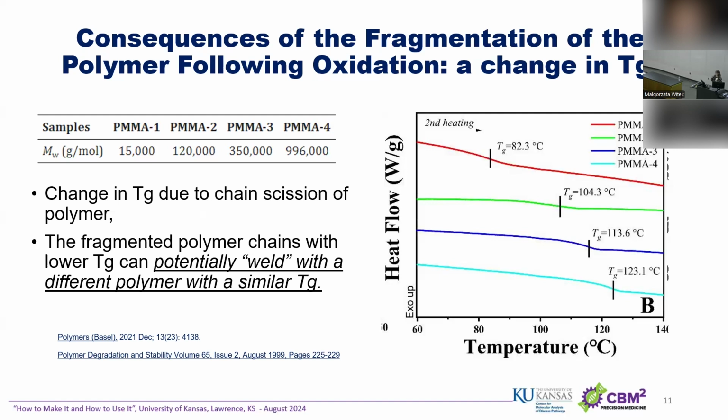When we do UV modification of thermoplastics, you can lower the temperature at which you do assembly, because the top monolayer of chopped polymers will act as a glue on your substrate and your cover plate. So this is not a deal breaker by any means.